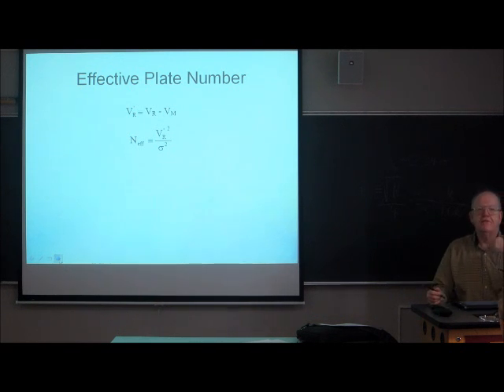So is it fair to calculate your plate count using a volume that includes the mobile phase or not? Some people said no, it's not fair to include that because it's not contributing to the separation.